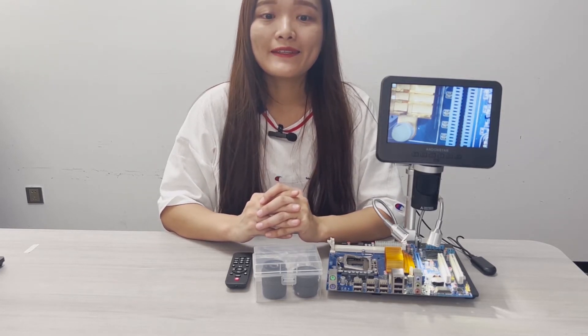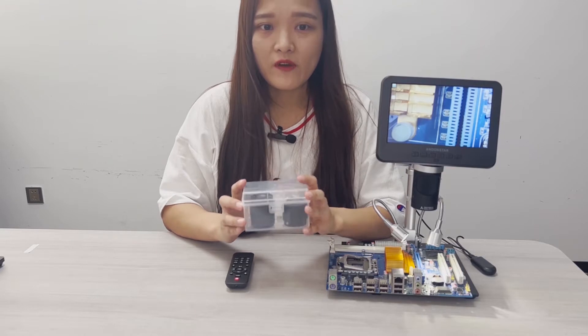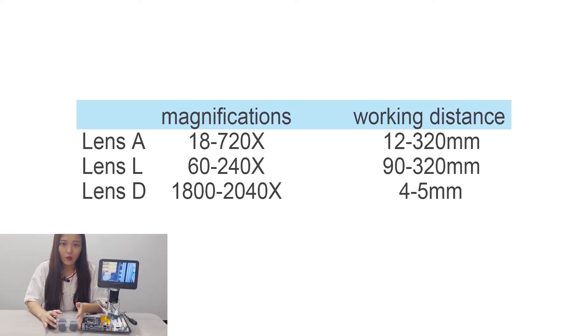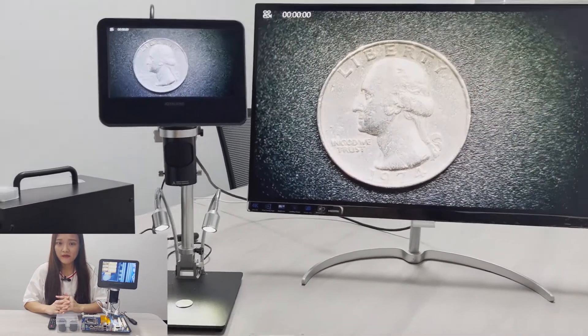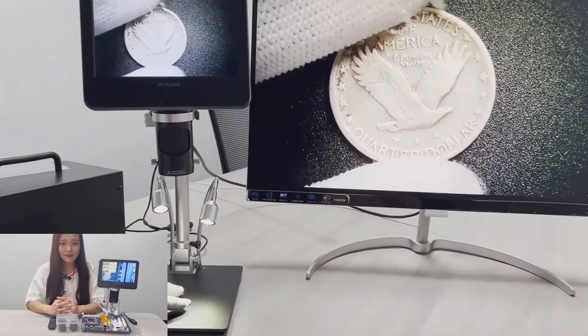If so, I'd say this model probably could help a little, because it comes with three lenses that cover a wide range of magnifications and suit different purposes. Here is a sample sheet of all three lenses, their zooming ratio and working distance. Conclusions are: Lens A works with most specimens, Lens D is specific for slides, and Lens L is designed for high working distance needs.